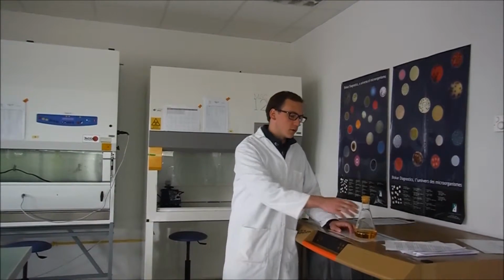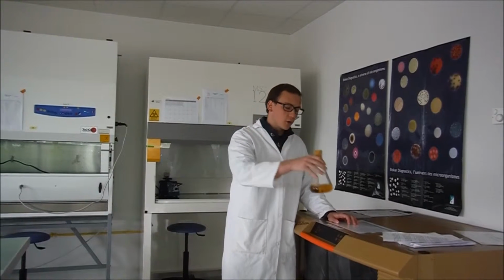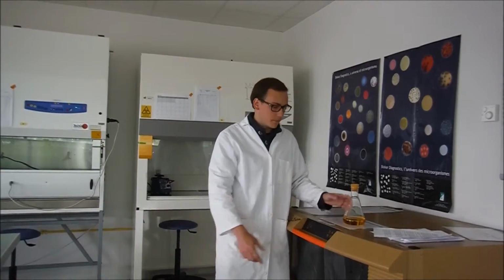Before starting protein production in the bioreactor, a starter culture has to be prepared. In order to do this, bacteria selected in the previous step are grown in a small volume of medium, about 10% of the final volume. This allows bacteria to adapt to the medium and to the culture parameters such as temperature and stirring. When their growth rate is at its maximum, all the preculture is transferred to the bioreactor, which is pre-filled with the same growth medium, about 90% of the final volume.